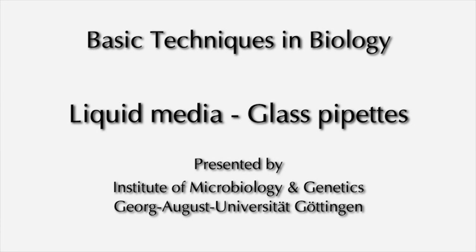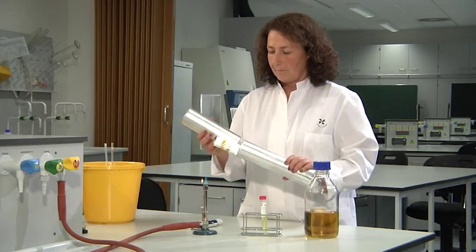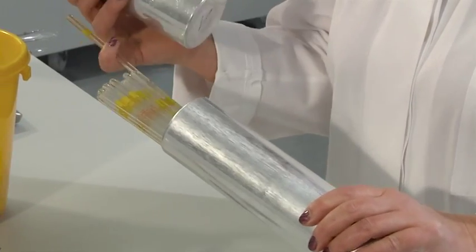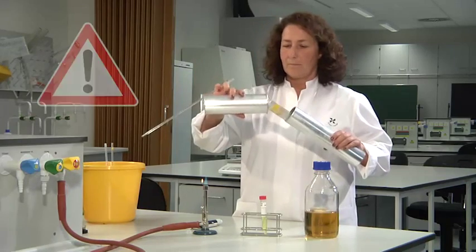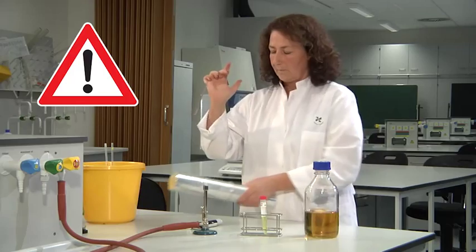Heat sterilized glass pipettes are kept in aluminum pipette containers. One sterile pipette is taken out of the container. When closing the container, be sure not to contaminate the other pipettes or the inner surfaces of the container.